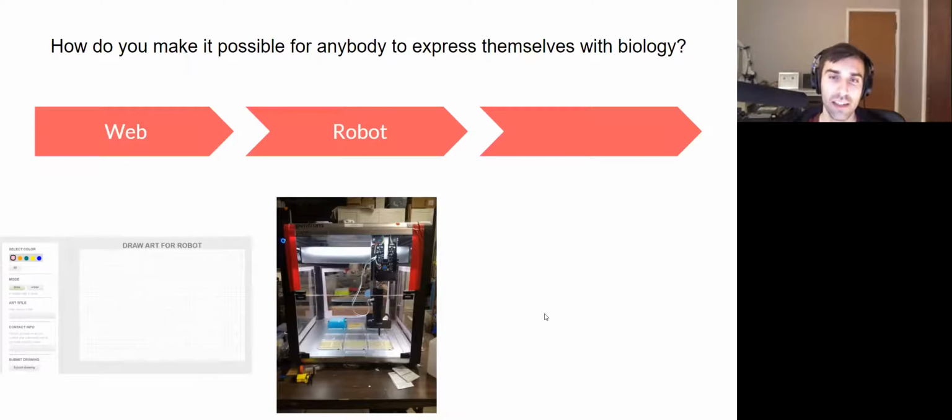And then this is the second part, and this is a really, really early prototype. We've actually been doing most of this on the command line. This is an early prototype for what a graphical user interface for getting the art looks like. Here I've got a grid of everything people have submitted. I check all these checkboxes to say, yes, I would like to print these on the robot now. And then you hit download print protocol. What happens is it translates that into robot code via template. Then we just pop that on the Opentrons, and the Opentrons is able to print these. So those are our big user interface pieces of software.